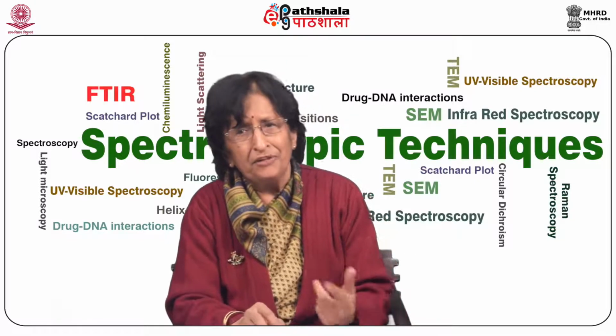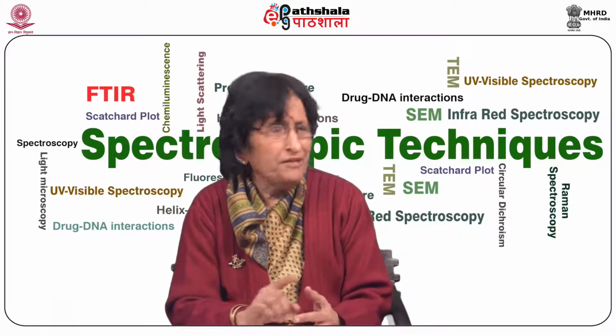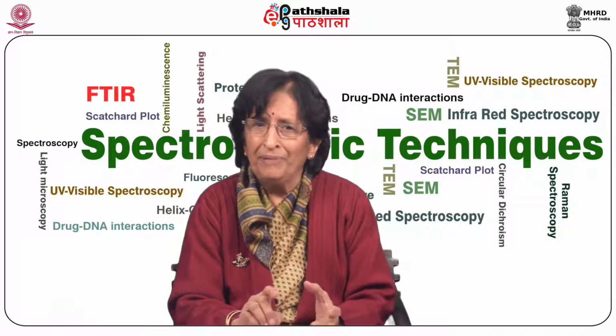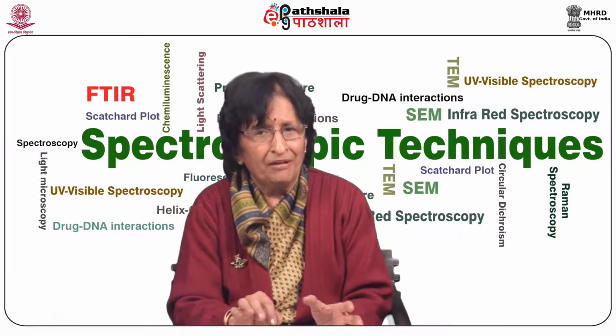The quantitative estimation of DNA and RNA is based on the fact that the absorption of DNA, RNA and their constituents follow a particular pattern. Quantification can be done on the basis of Beer-Lambert law.